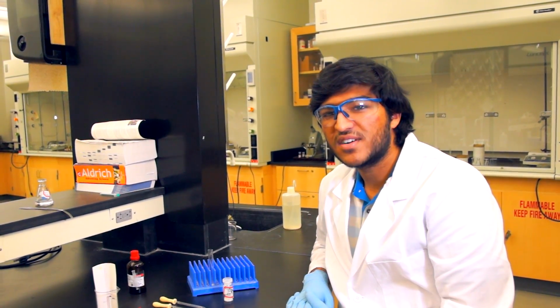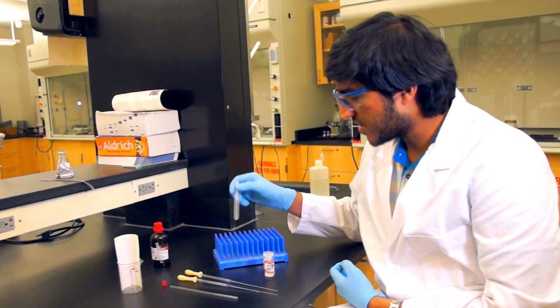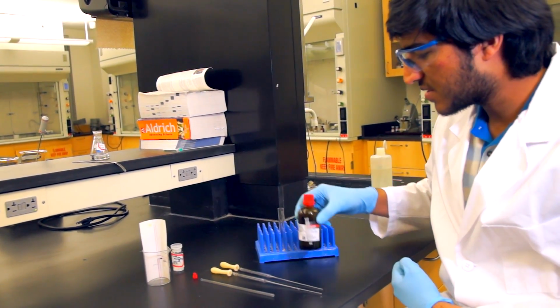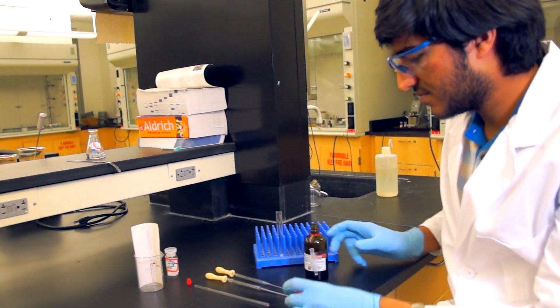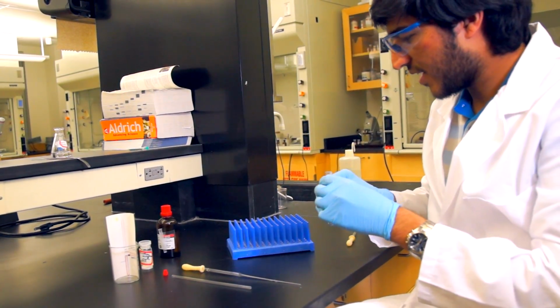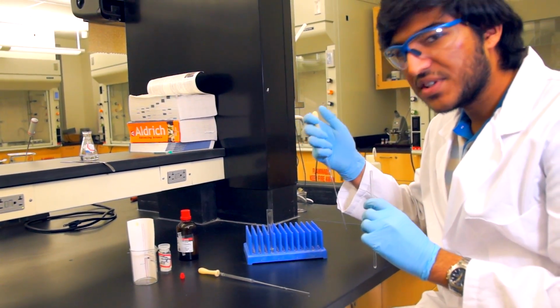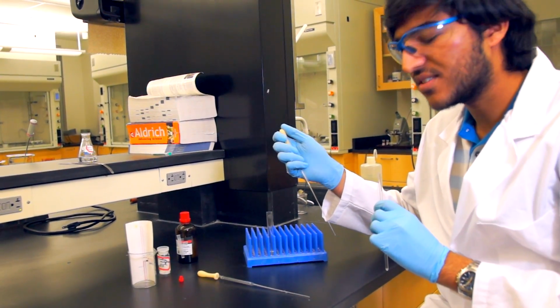So now we're going to learn how to prepare our NMR sample. We're going to take our sample and add about 2 milligrams to a test tube, like we've done here. Now we're going to add just enough NMR solvent to dissolve our sample in the test tube. In this case, we're using CDCl3, or chloroform D. Add a pipette full of your solvent to the tube to dissolve the sample. Now, I'm going to transfer the sample to my NMR tube. I'm going to use the same pipette, but I'm only doing this because I'm not going to put this pipette back into the CDCl3 bottle. That would contaminate it.